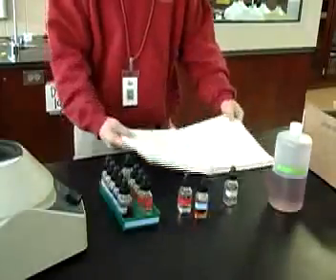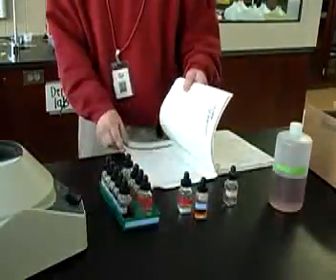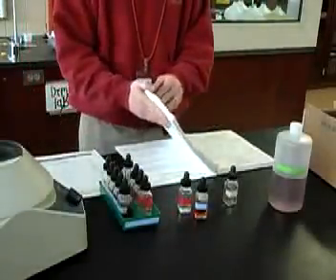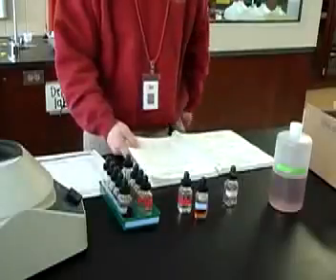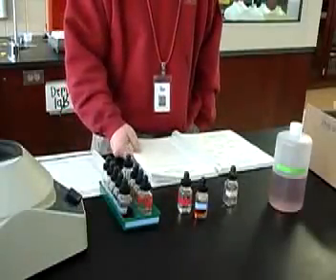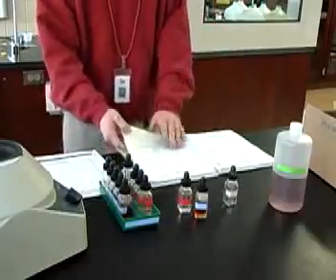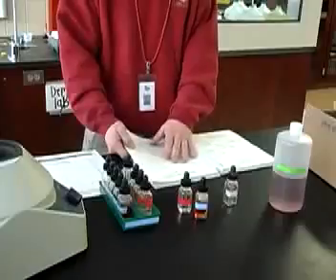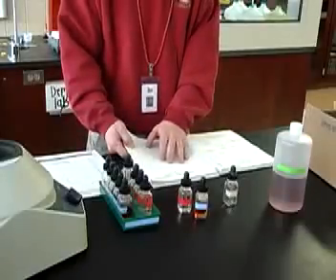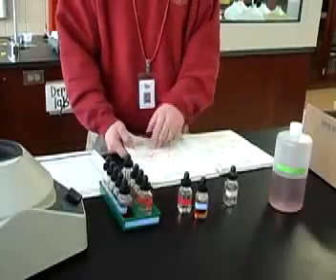So preliminary lab assignment, on mine it says page 137. Yours it's page 99, is that right? Page 99. So question number 1 says, use the flow chart at the end of the experimental procedure to answer the following questions. In each question, a test is carried out to determine the presence or absence of several ions. Only those listed may be present. State if the test indicates if each ion is present, absent, or undetermined.